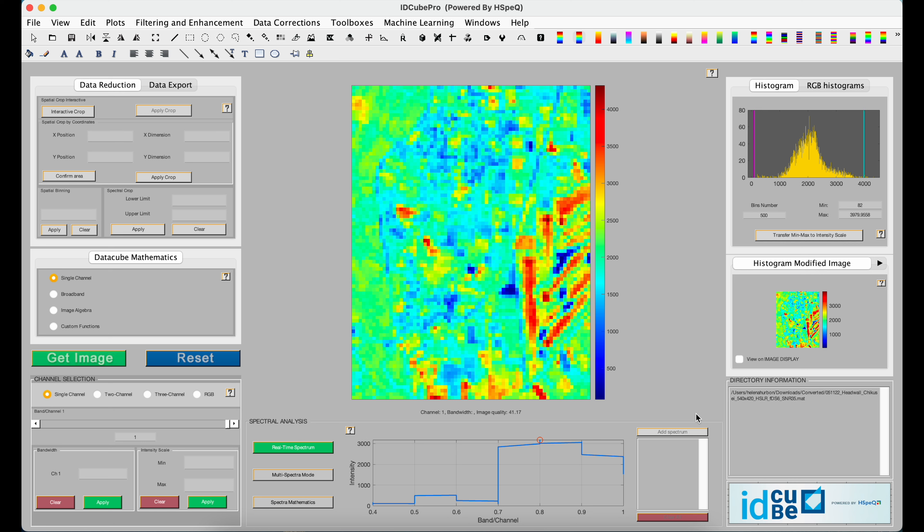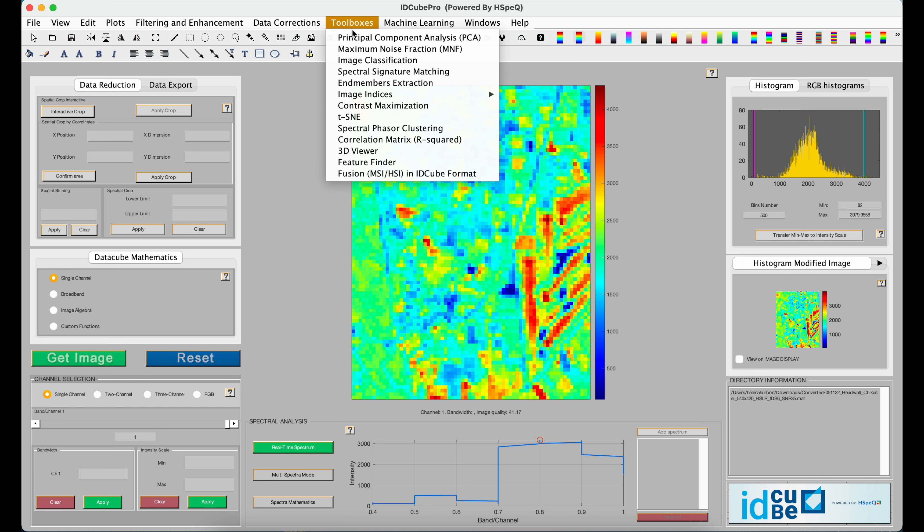To start, you'll want to open a dataset, and it doesn't have to be the dataset you plan to fuse. Then you'll navigate to Toolboxes and select the last one, Fusion.